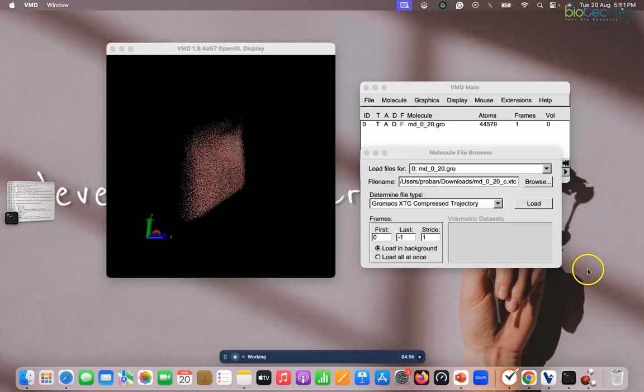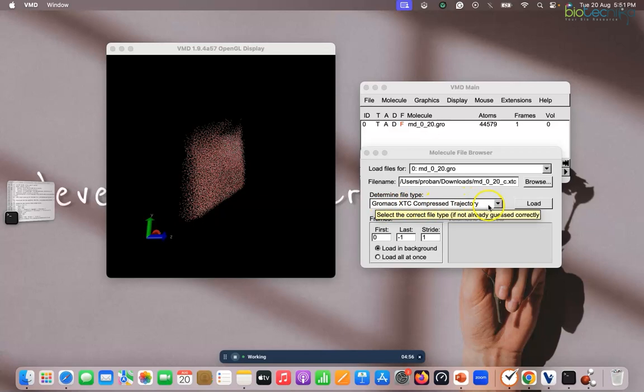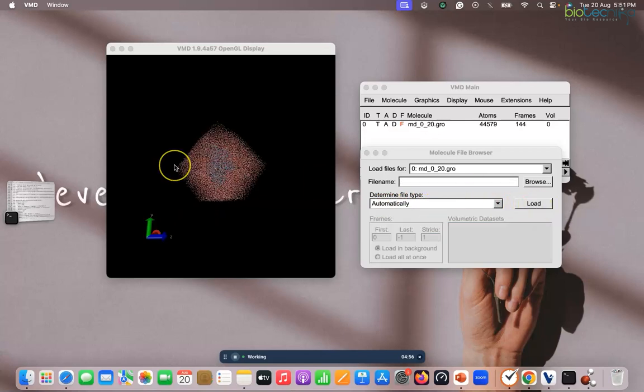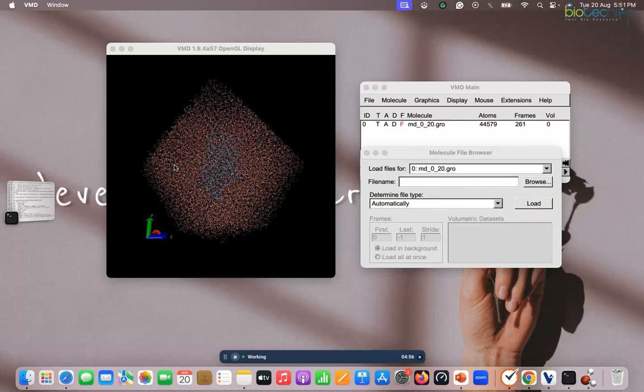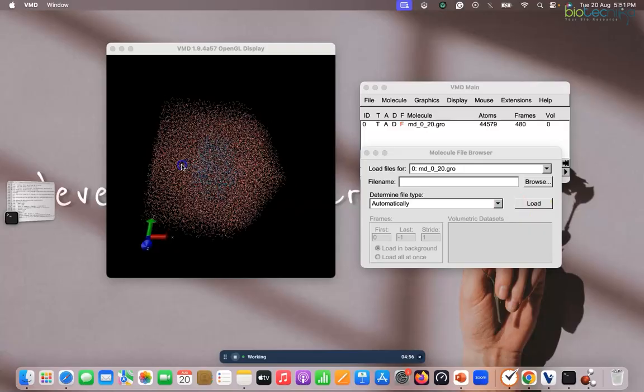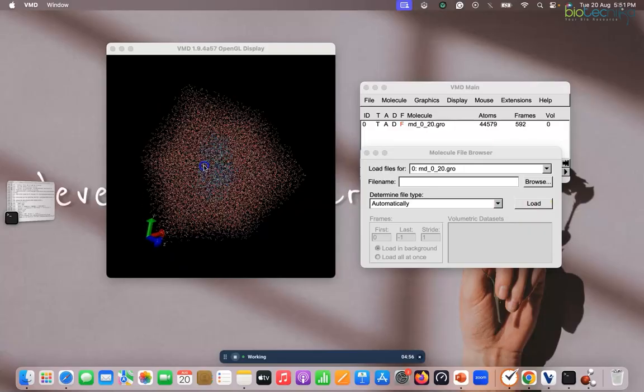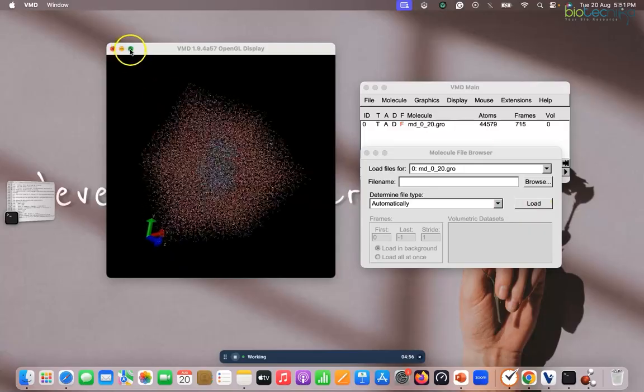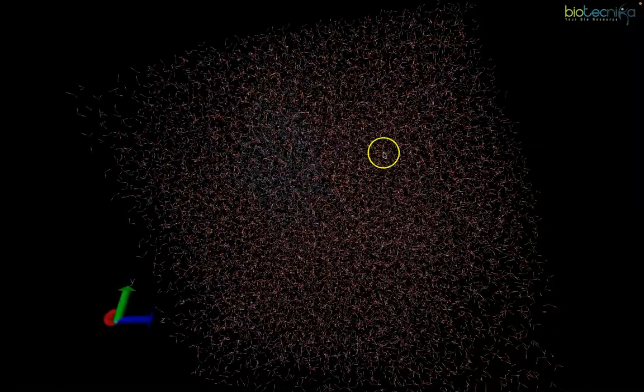So if I hit on this, and now see the GROMACS trajectory compressed trajectory file is loaded. If I now load it, so now you can see this is the simulation running. So I can maximize it to show you. Here you can see, so this is the file, this is the protein in between, the blue, in blue color it is represented, and the outer one is your environment here you can see.